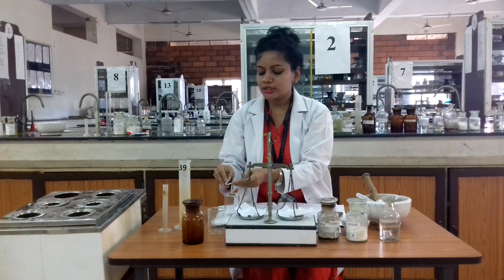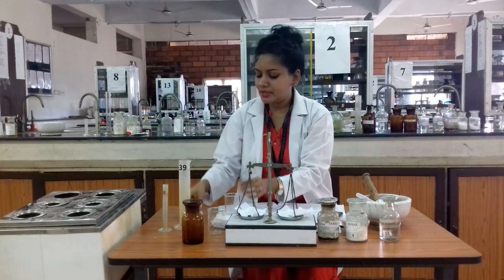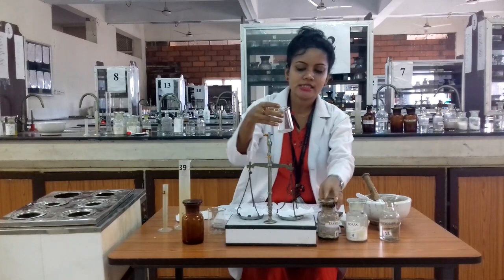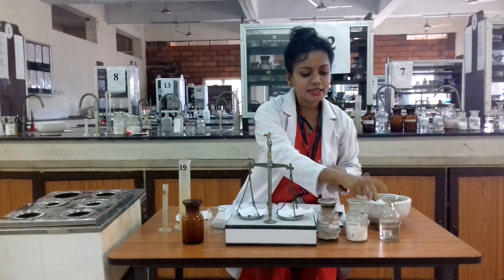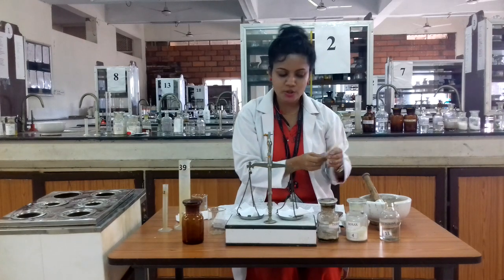Both ingredients — tannic acid and borax — are transferred to our beaker. Next, our third ingredient is glycerin. Glycerin acts as the vehicle in this preparation, so here we add 20 ml of glycerin.